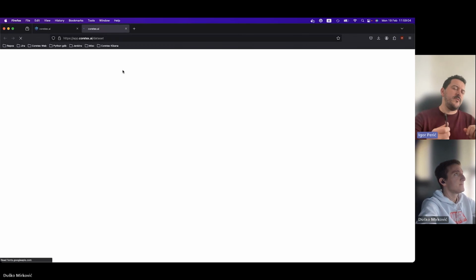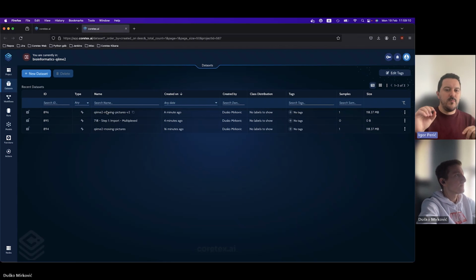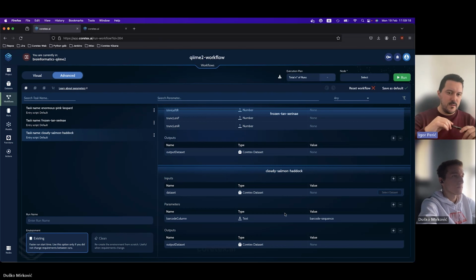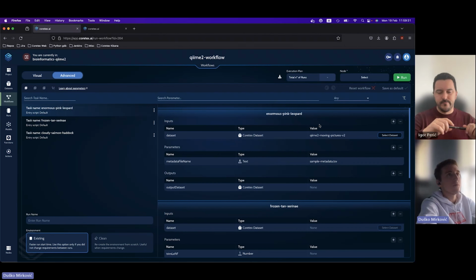And we had a rerun feature at one point, no? I'm not sure if it's still there with the recent changes, but cases like these would be able to be rerun faster when you select one task. And then it pre-populates all of the parameters that you previously had in there. You can just change, in this case, dataset. Or for example, you could do save as default right here after entering all the parameters. And when I press this, next time I open this workflow, it will reuse the same parameters.